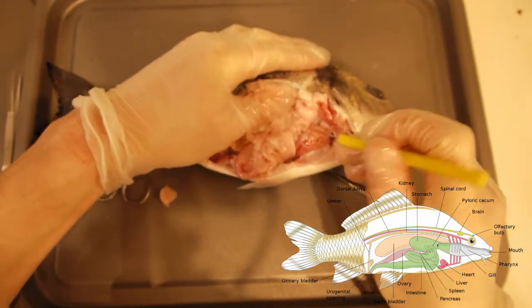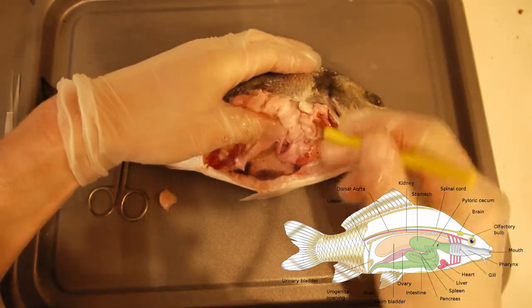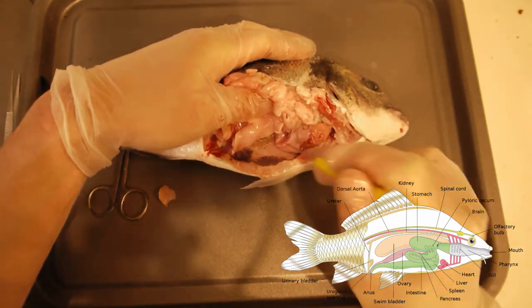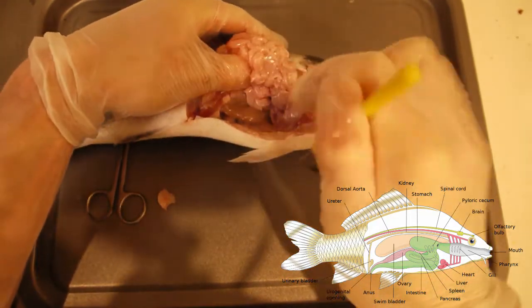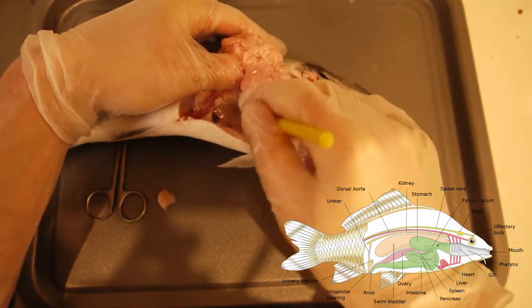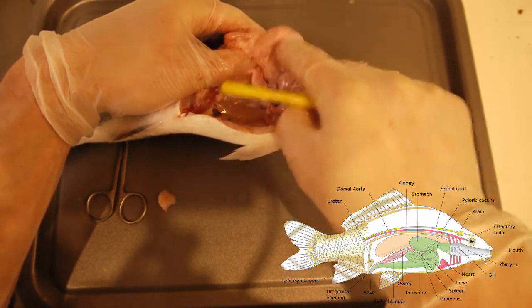Let's get a teasing needle and have a look at what we can see. Here we have the stomach, we have the liver, and then here, just going down there, is the duodenum. And this transparent structure here is the swim bladder, which I'm going to be very careful not to deflate because it's full of gas.